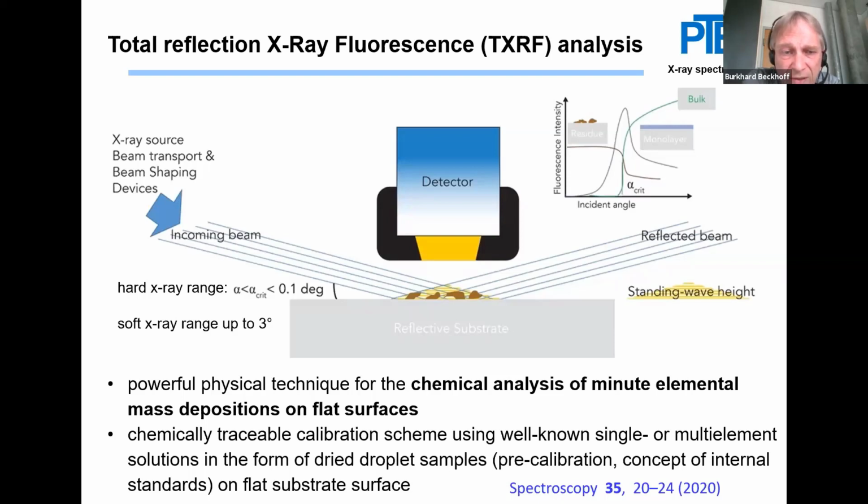TXRF analysis is a physical technique using, for example, monochromatized X-rays to excite a minute amount of substance on a flat surface and probe the element-specific fluorescence radiation, or to be more precise, the intensity of the element-specific fluorescence radiation by means of an energy dispersive detector.